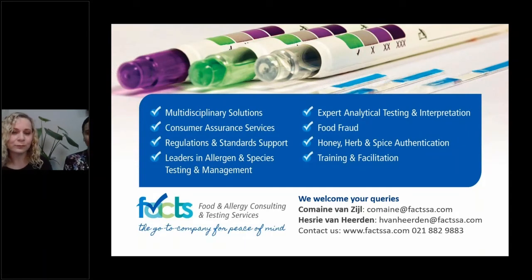Yeah, it does. Sticking with that, Hezri, you mentioned the importance of understanding the denaturation of the proteins during your process and understanding what that means with regards to the allergen kit. So Justice has a question here, and I've got the same one. Is the allergic protein component in whey powder structurally different to the one found in milk? In other words, would I have to test to detect milk and to detect whey powder if I'm using both ingredients, for example in a yogurt, where I've got a lactose-free yogurt and then I've got a normal yogurt?